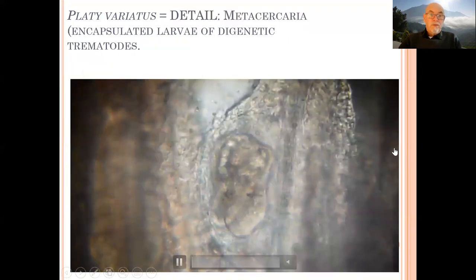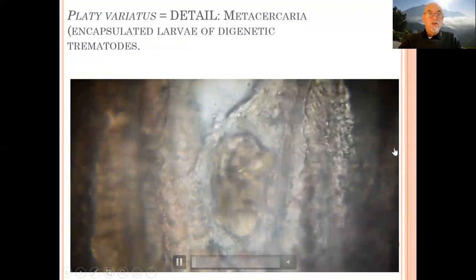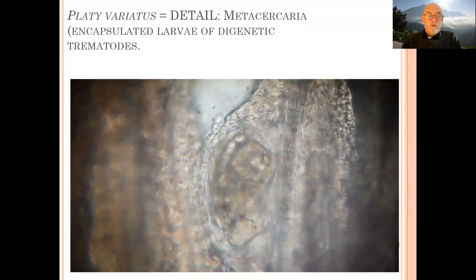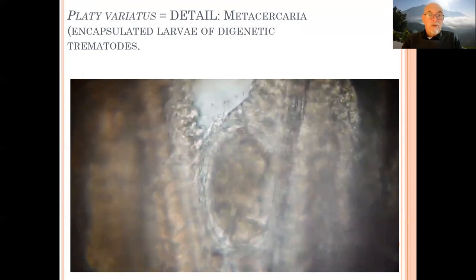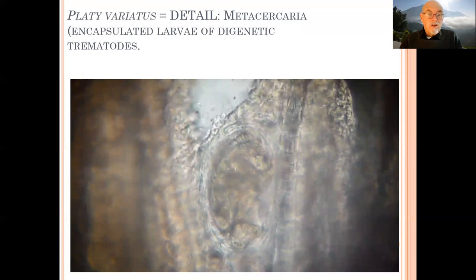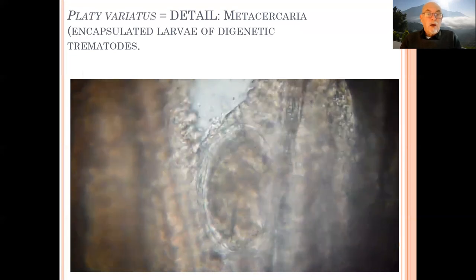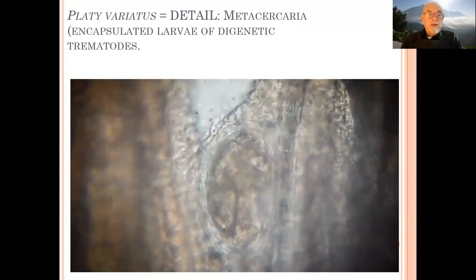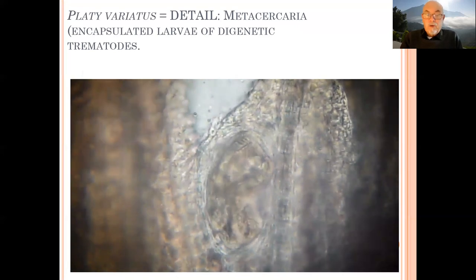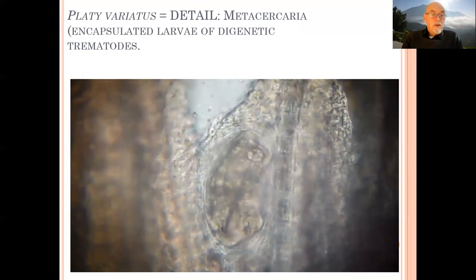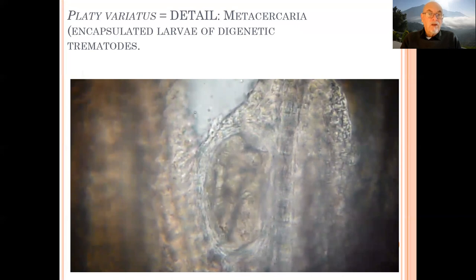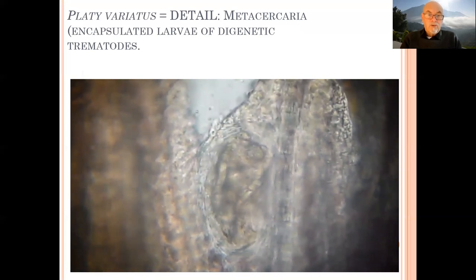Here we show in detail the worms — a larva that for a certain time is alive and moving. When this larva is eventually eaten by a big predator, a bird, another fish, or a mammal, it will eventually develop into a larger worm, an adult digenetic trematode.